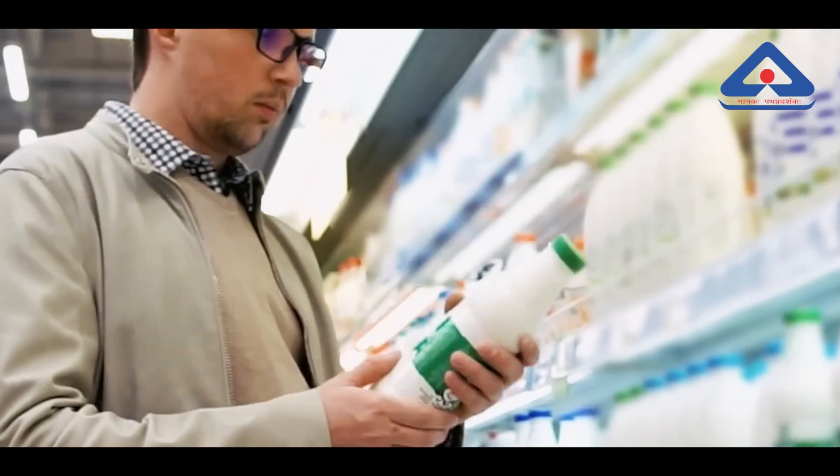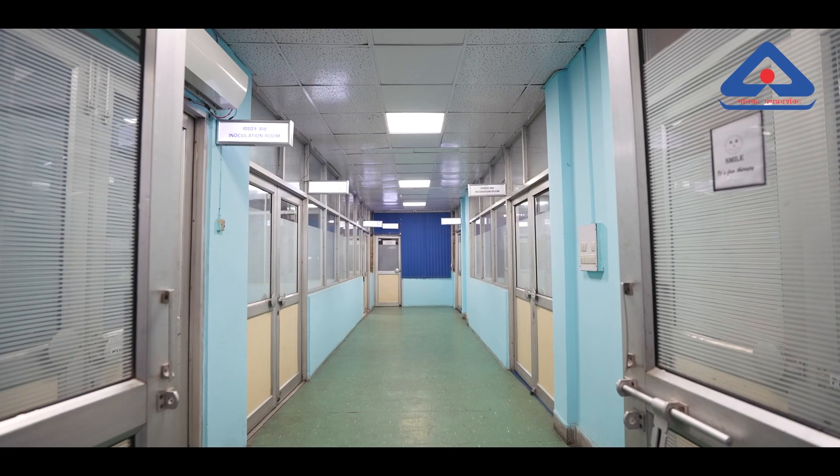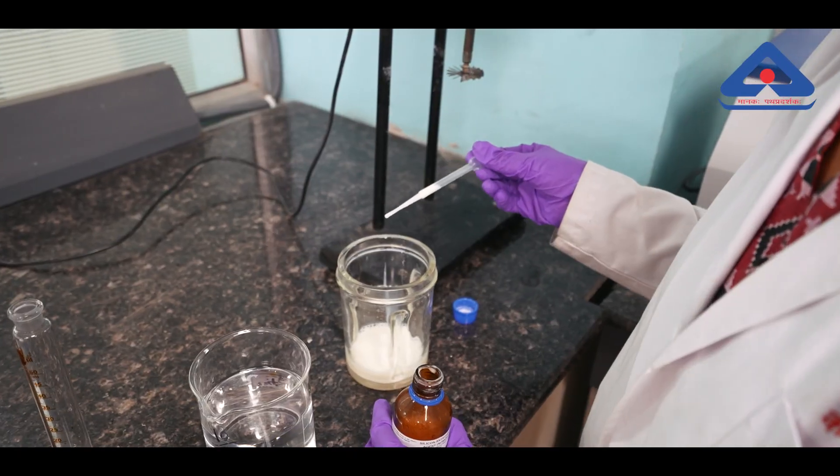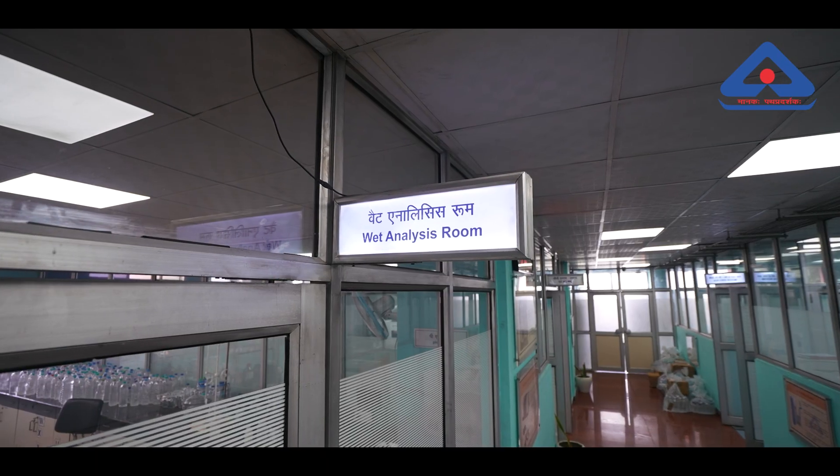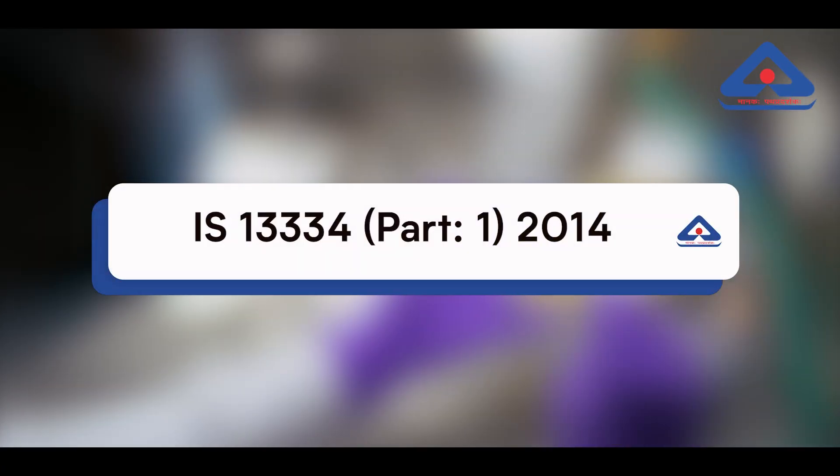Once the skimmed milk powder is produced, it goes through rigorous testing at Bureau of Indian Standards lab facility to ensure it meets quality and safety standards as per IS 13334 part 1 2014. Let's take a look at some key tests.